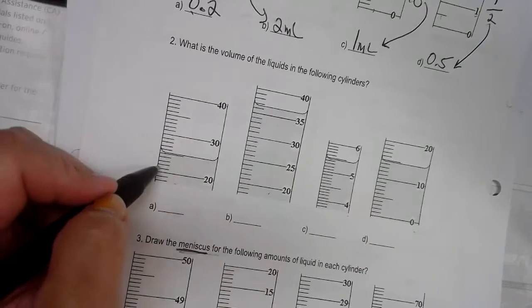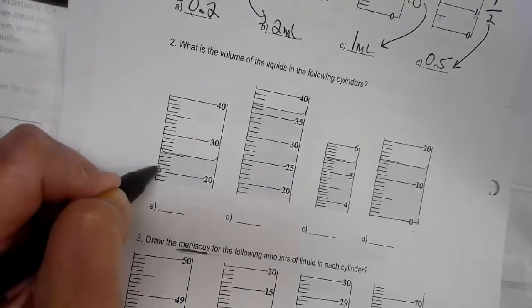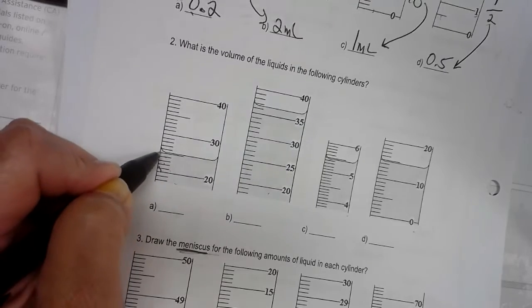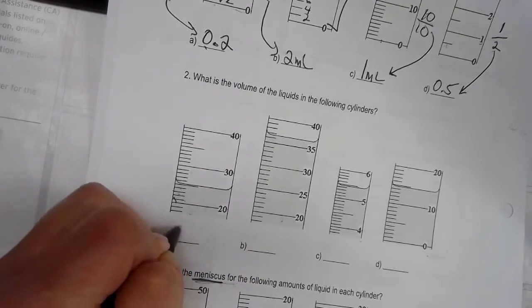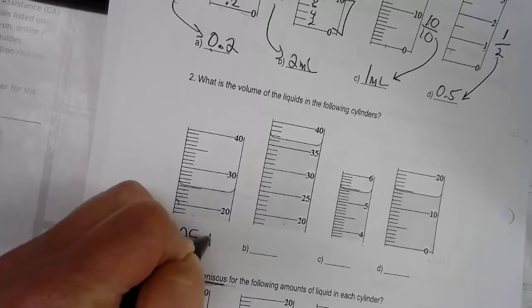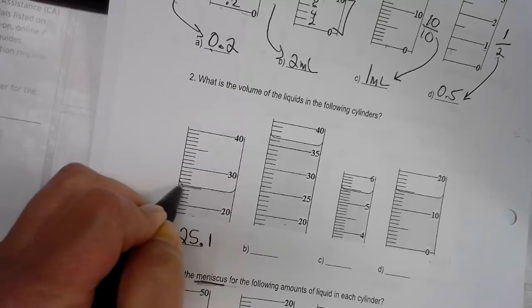I wanted to show you when you have 10 lines in between, you're going to literally call this 20, and then the next line 21, then 22, then 23, then 24, and then here we're at 25. And actually, as you read it, the actual reading is a little bit above 25. So you definitely have 25, and then you're going to go a little bit above it. So you're going to definitely put the 0.1. If it is exactly on the line, it's not quite here, but it is very close.